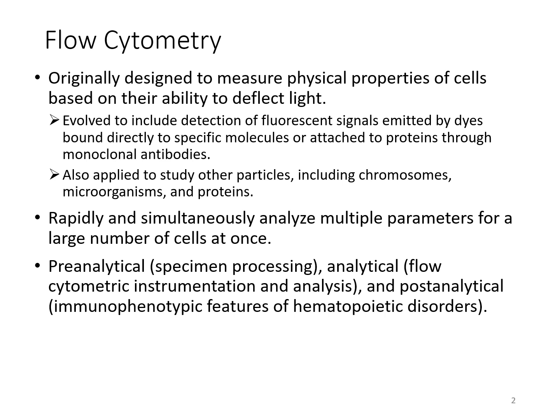And what it does is it just speeds up the process. Where we used to have to look at cells and use special stains, now we can look at multiple cells simultaneously as they run through the analyzer, looking at various parameters for all of those cells at once. Advancements now allow us to use various fluorescent dyes, which when they're run through the analyzer will emit various signals when those particular dyes are bound to specific monoclonal antibodies, and that allows us to diagnose various hematological malignancies.